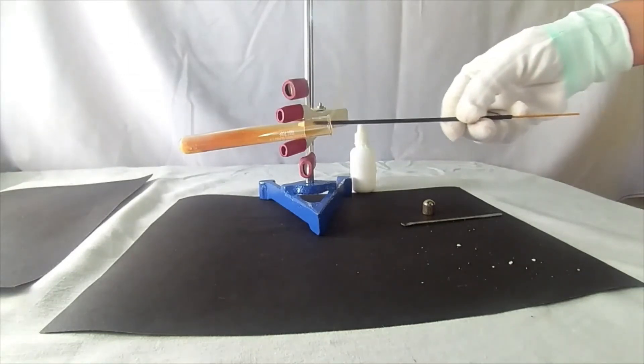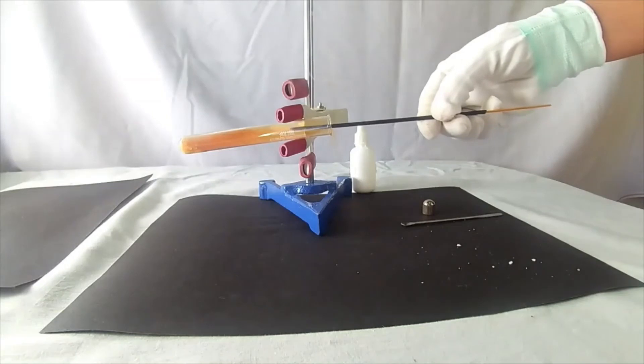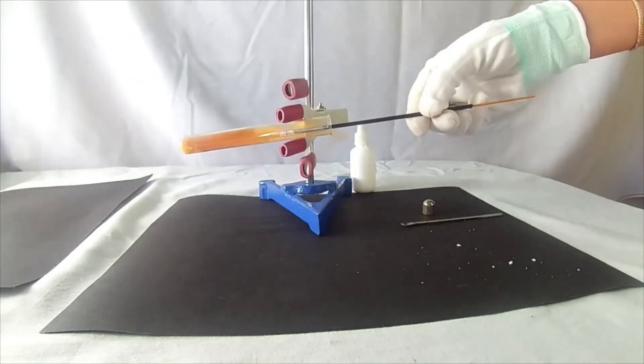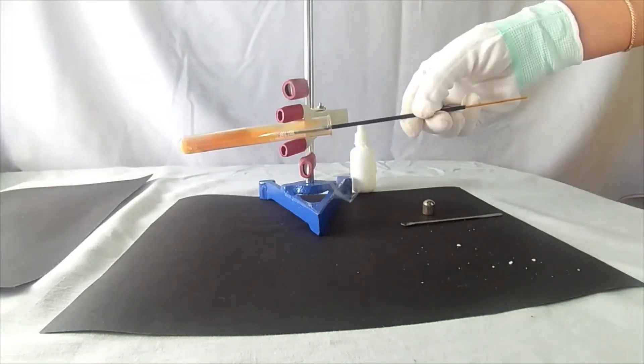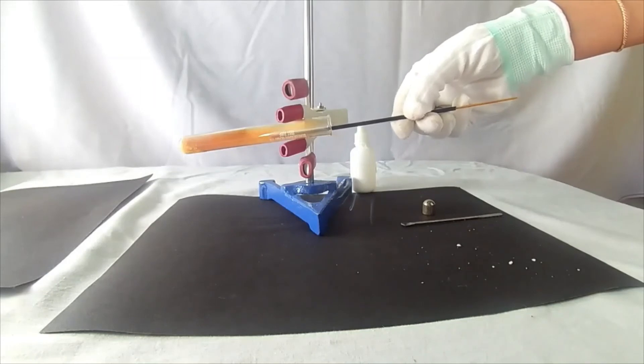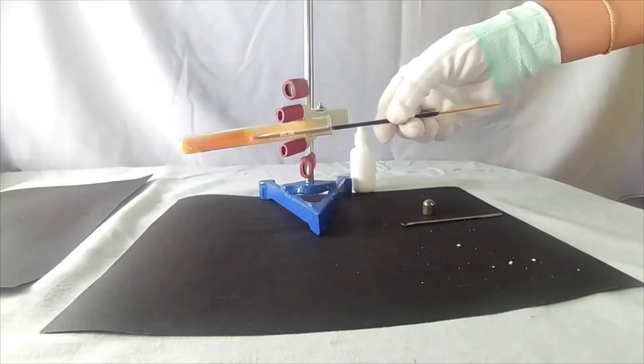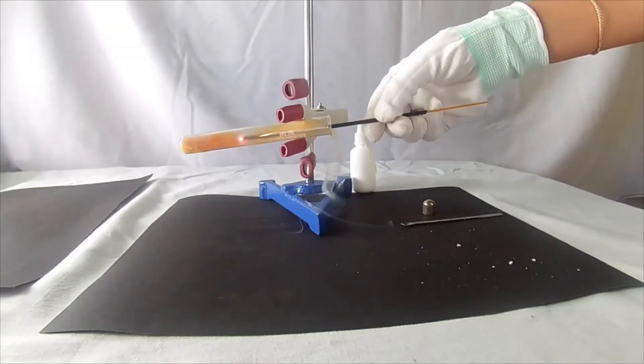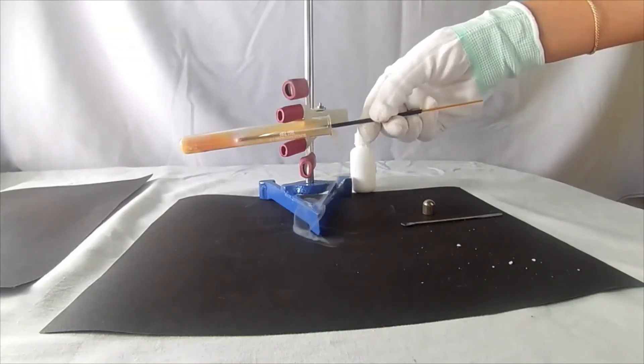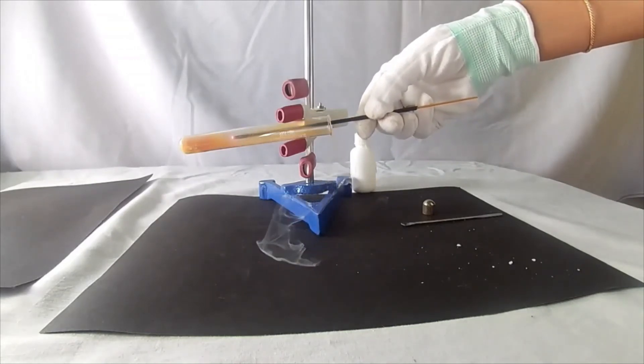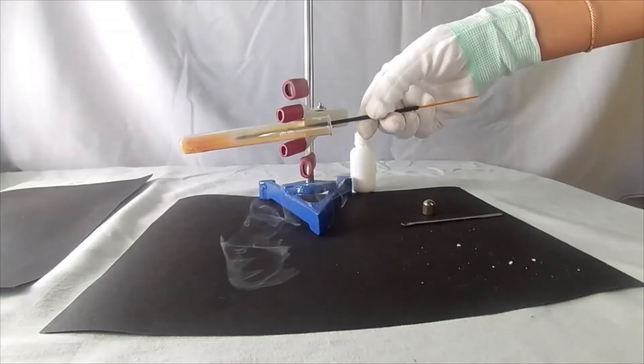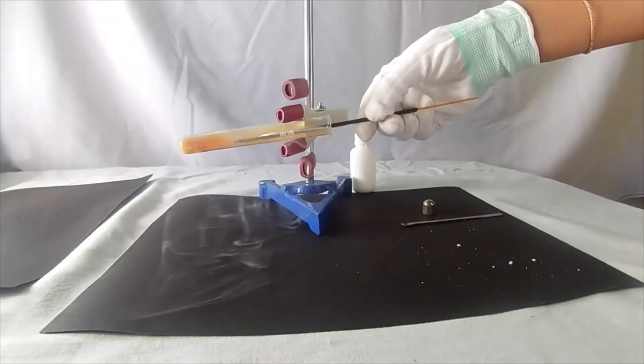Introduce a burning splinter into the test tube. It catches fire indicating the presence of oxygen. Observe carefully. Yes, it is. Oxygen is present inside the test tube.